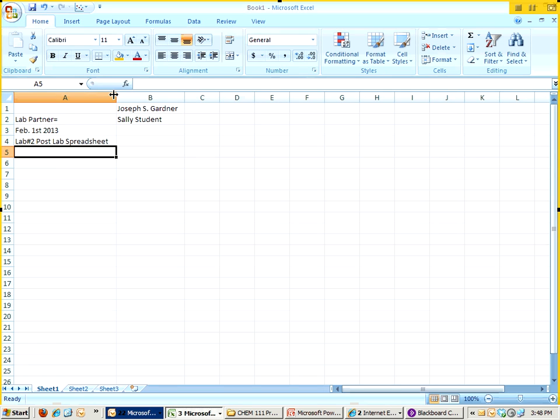The example I'm looking at here would include thinking about what the actual value is you're trying to measure, and you realize that you're trying to measure out 50 milliliters of water, and if you actually hit your target with respect to measuring 50 milliliters of water, when you weigh the mass, your true mass or your actual mass would be 50 grams, right? Because the density of water is going to be, to two significant figures, 1.0 grams per milliliter, or 1.0 grams per centimeter cubed would have the same meaning.